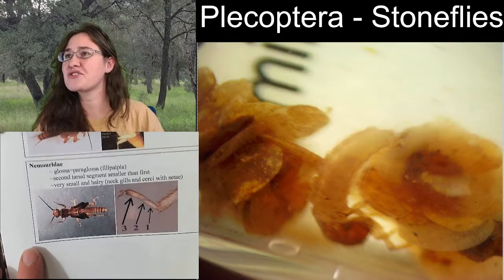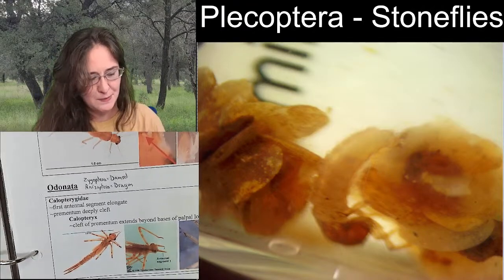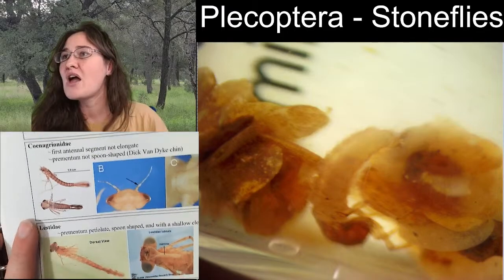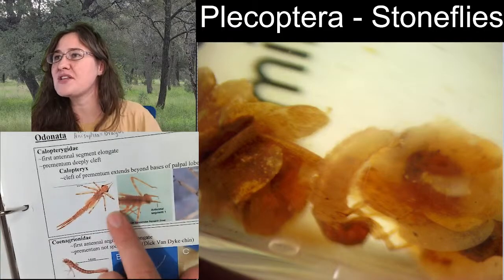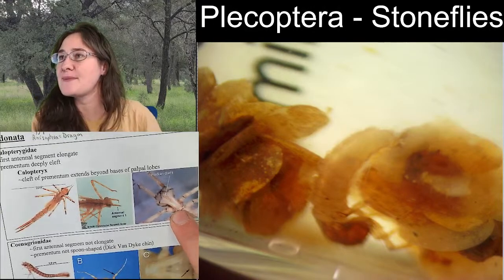Yep, so those are stoneflies. There's all different types, and I guess that's them. Damselflies. We already saw a damselfly under the microscope. Also have 3, except, ooh, I want to show you this.